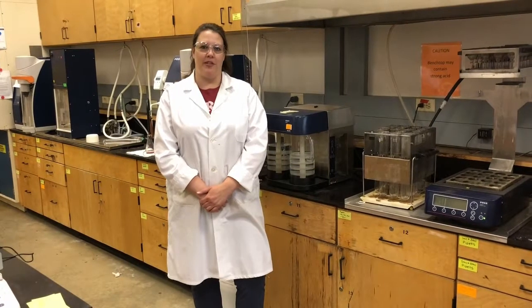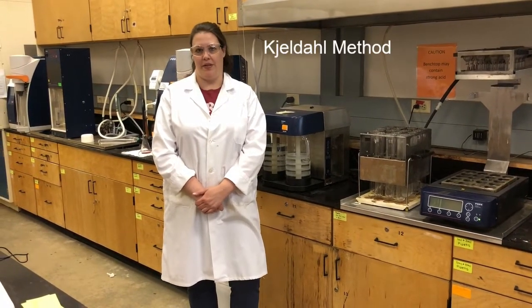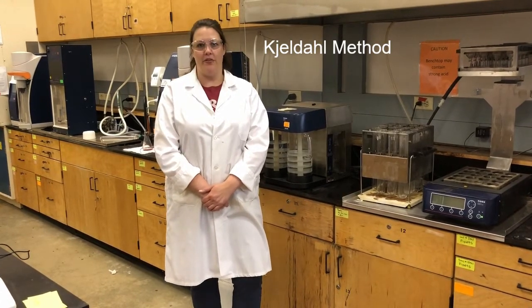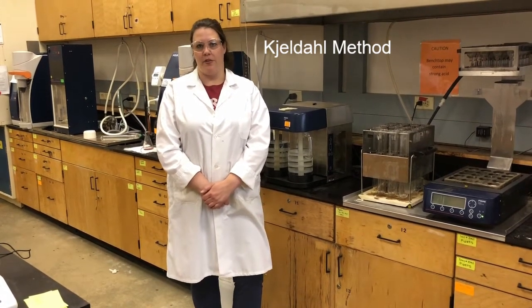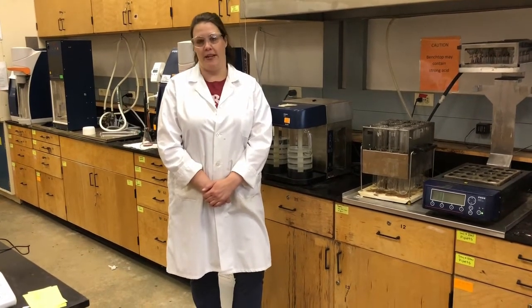So one of the most commonly used methods for determining nitrogen content is a method called the Kjeldahl method. It was developed in 1883 by a Danish scientist named Kjeldahl, so it was named after him. And even though it was developed in 1883, it's still really widely used today, as it is one of the most reliable methods for determining nitrogen in food, in water, or in any sample really.